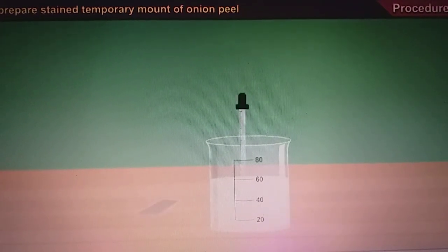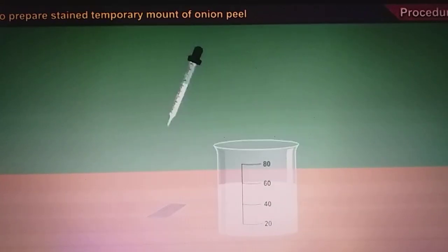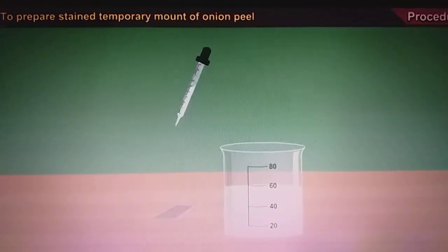Now procedure. Take a clean slide and in the middle of it pour a drop of water with the help of a dropper.